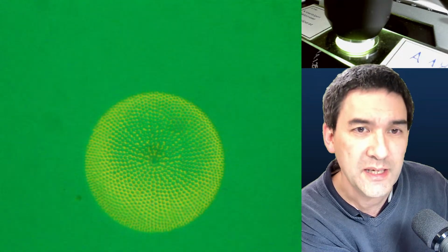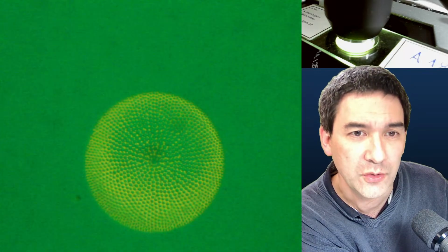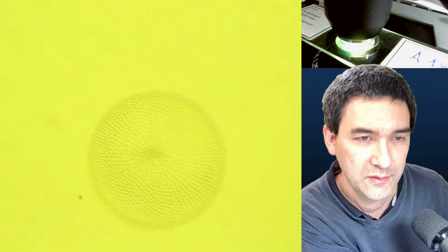In this case, I would make the central part a little bit darker. So I would simply add another one of the green foils over it, to make the green a little bit darker. Then there is a bigger contrast. And what do we have next here? Ah, yeah, red, blue, for example.